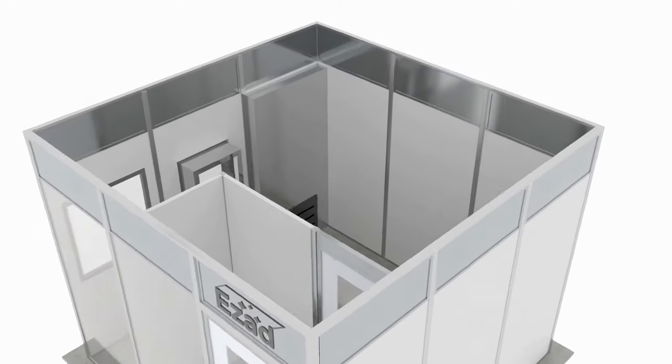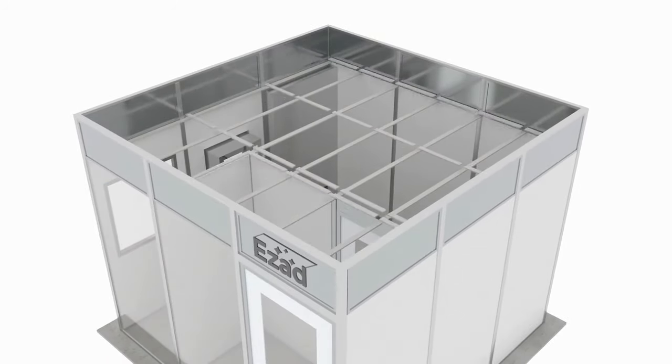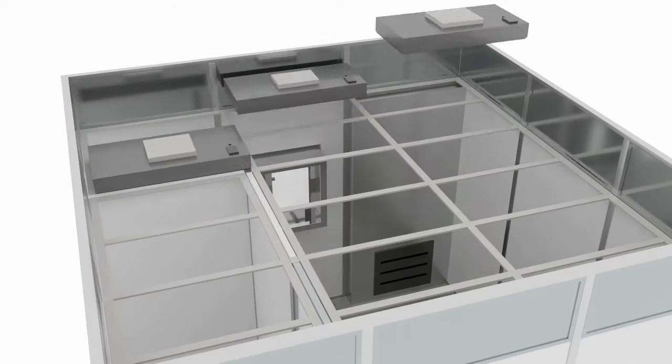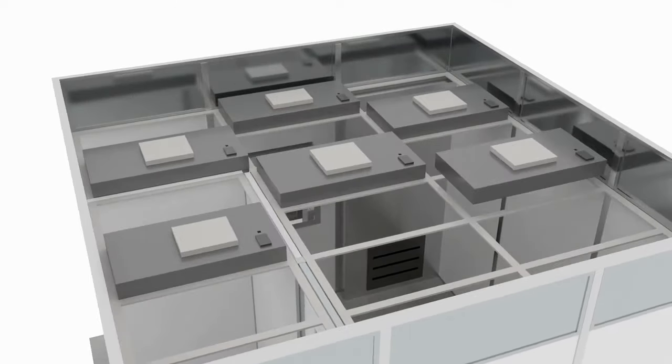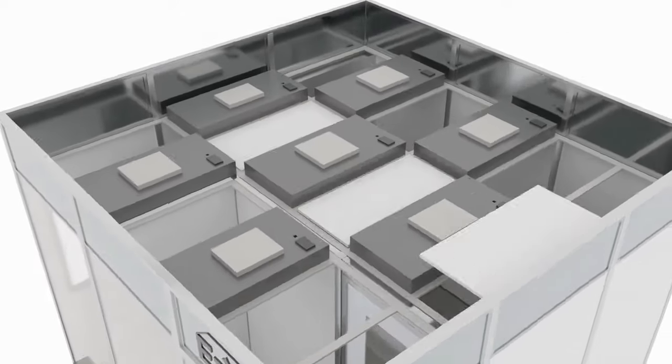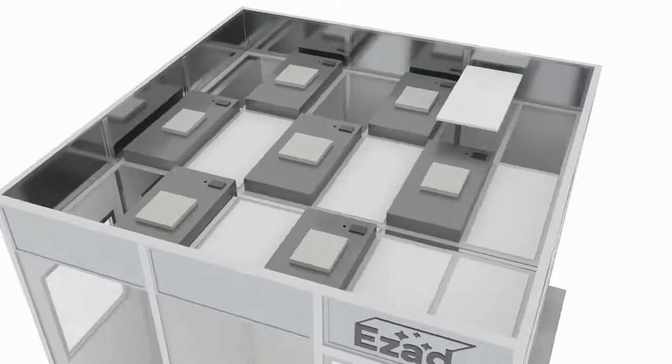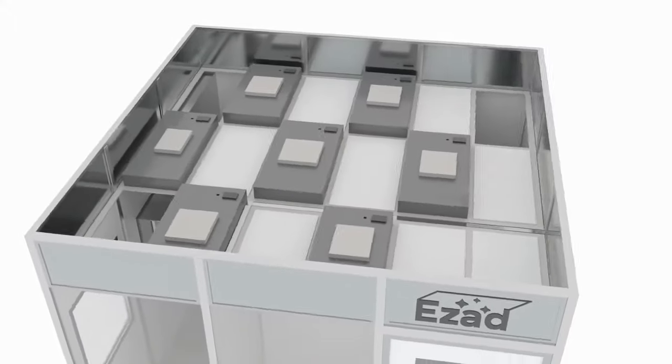Ceiling grids are robust coated steel frames that hold the HEPA fan filter modules and LED light panels. Finally, cleanroom ceiling tiles are placed to complete the system.